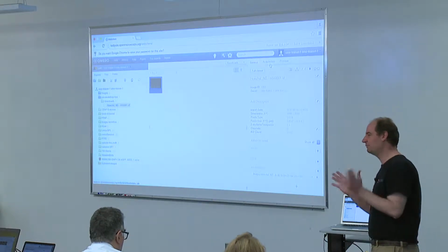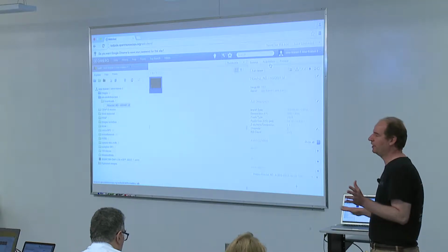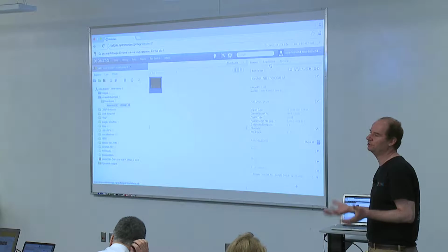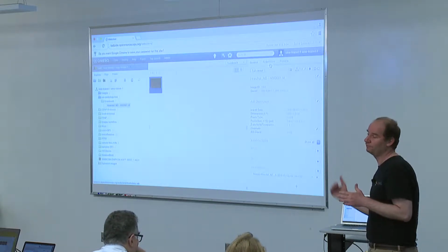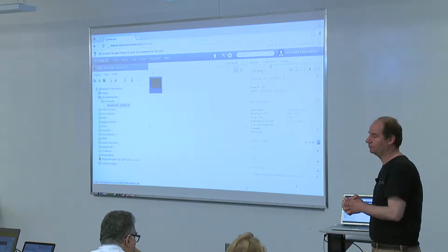A server is something you would have in your institution. It's not going to run on your laptop. It's not going to run because you overnight thought that you will have a server and you will use it. Yes, you can do it, but it has some cost to install a server. The server is for free as well. It's software like any other, and you can find it on our downloads page.